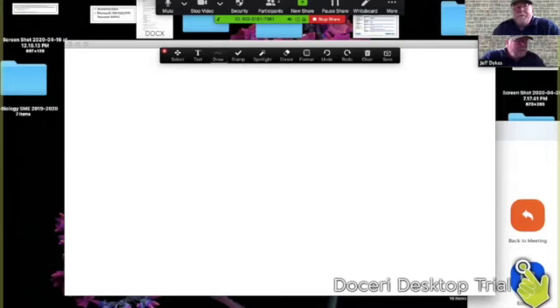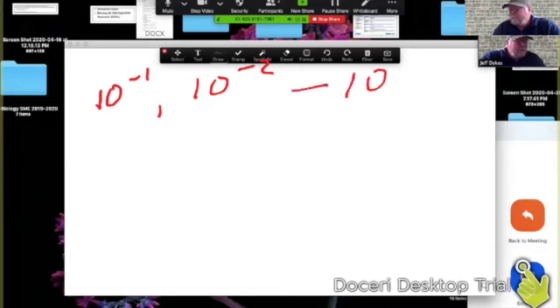We first did a serial dilution, taking 1 milliliter of the bacteria solution and putting it with 9 milliliters of saline. And so that was a 10 to the minus 1 dilution. And then we did a 10 to the minus 2. So we took 1 milliliter of the 10 to the minus 1 and diluted it to 10 to the minus 2, all the way up to 10 to the minus 8. Okay, and so that was one serial dilution.